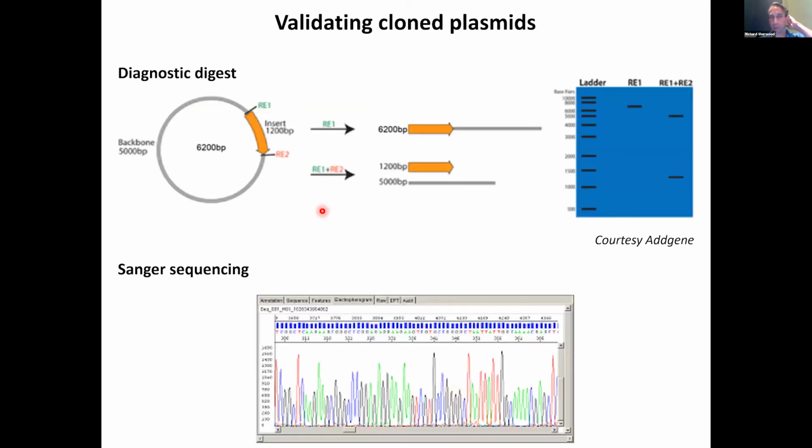And then, following up with the basics, how do we verify that we got the right sequence? Because no matter what you do, if you do restriction enzyme digestion of your vector, sometimes there is remnant circular plasmid left after you cut out your gel band. Or at some rate, you can get recombinations using Gibson assembly, where it uses a different homology because the exonuclease can chew back such a long region. You can actually get deletions depending on your strategy.